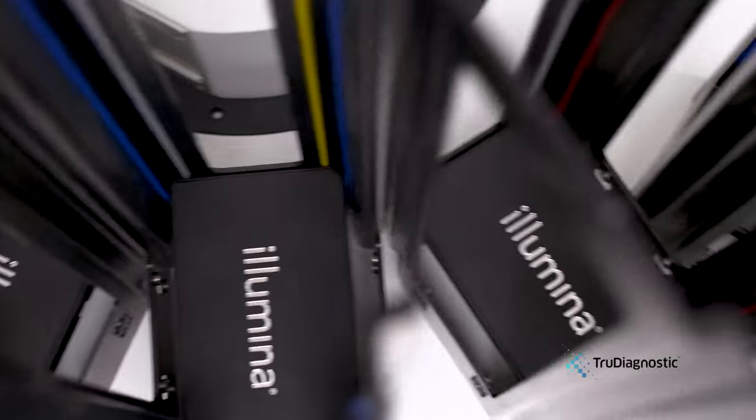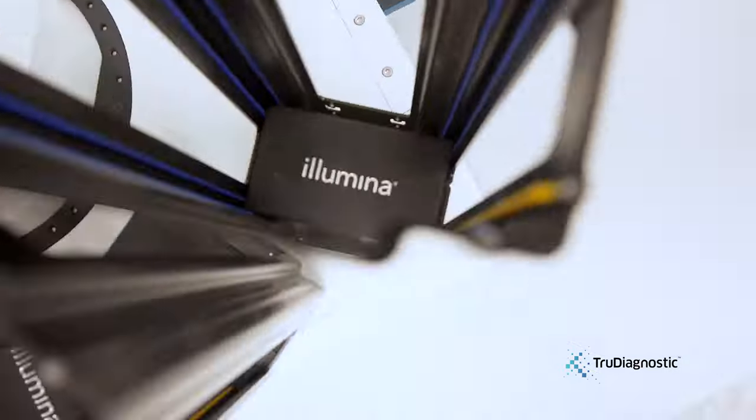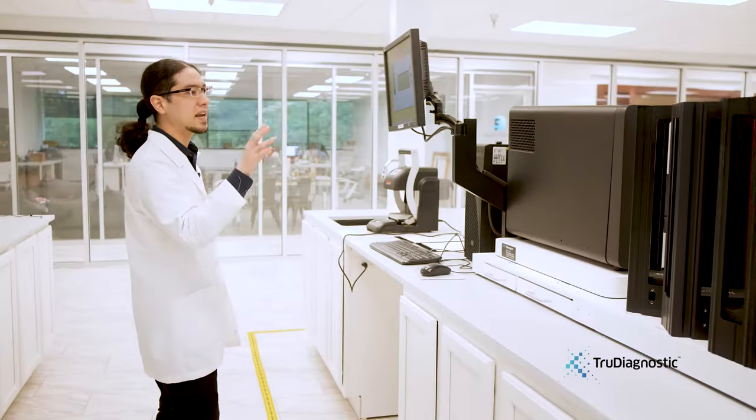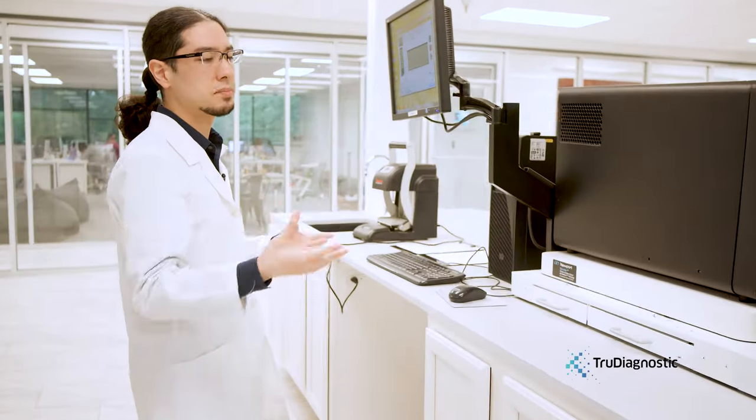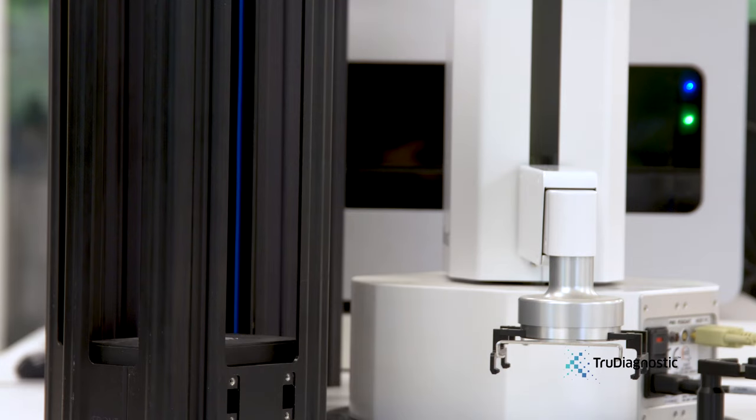This particular machine uses a dual-colorimetric detection system to allow us to detect those methylation sites, and using the system we currently use, we can detect up to 850,000 sites.